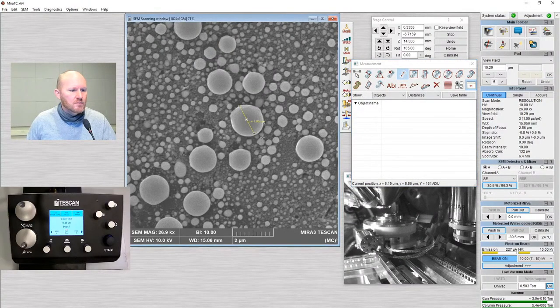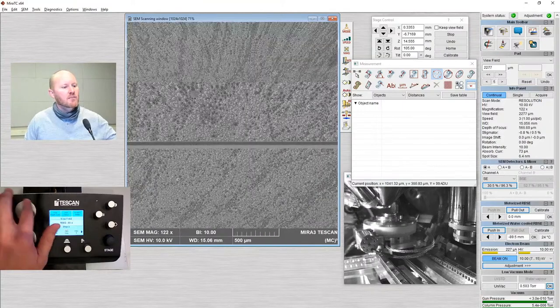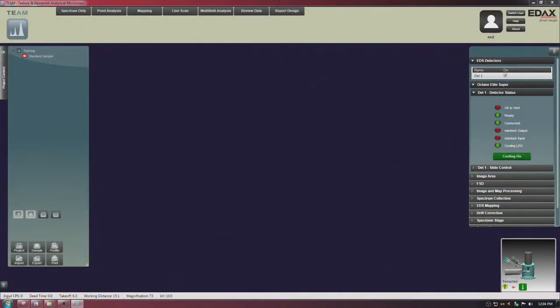The onscreen measurement tool is great just to give you an idea of the size of features. But if you really want to do a lot of particle measurements, I suggest something like ImageJ. I could measure many of these — they're just point-to-point measurements. I also have the option of getting radius information, but none of that shows up in the table unless I'm working from a saved image. Our detector is now cooled down — let's go over the EDS collection.